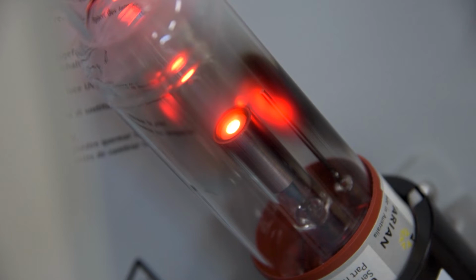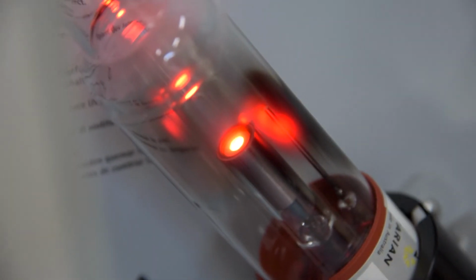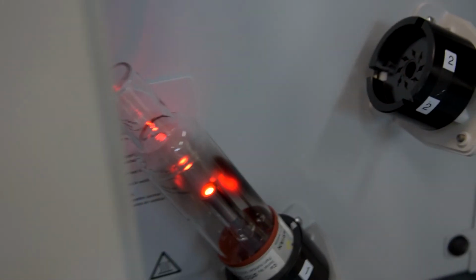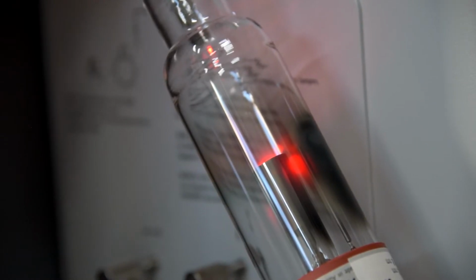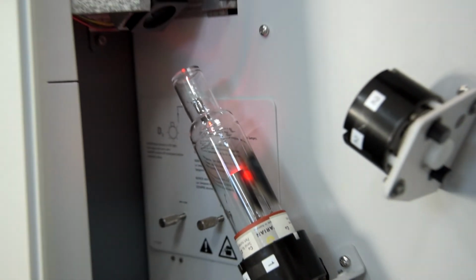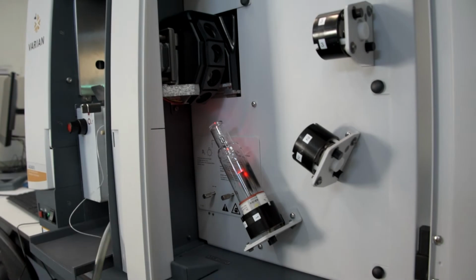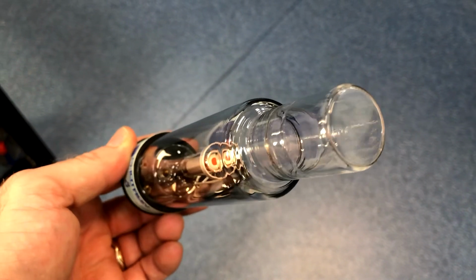A hollow cathode lamp is a light source used for flame atomic absorption as it offers several advantages over other light sources. The absorption of light by atomic species occurs in very narrow wavelength ranges called lines. The widths of these absorption lines are smaller than a nanometer. This means that a light source that only emits these very narrow ranges is preferred. The cathode of a hollow cathode lamp is made from the analyte of interest. In this case, the cathode is made from copper.